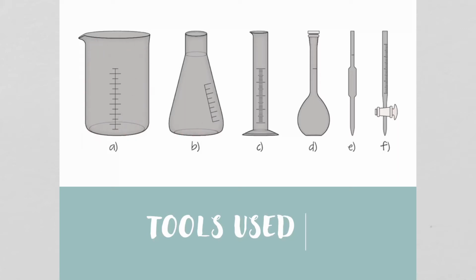A beaker is something that you would collect a large set of stock solution, but this is not something that you would use for precision measurements, nor is the Erlenmeyer flask. This one's a bit more precise, but to be absolutely precise, when we need to titrate a certain volume, we would take one of our pipettes and pipette that into here. And then this is known as a burette, and it is extremely precise, and you can release small amounts of solution into the Erlenmeyer flask, and that we will be using for our titration.